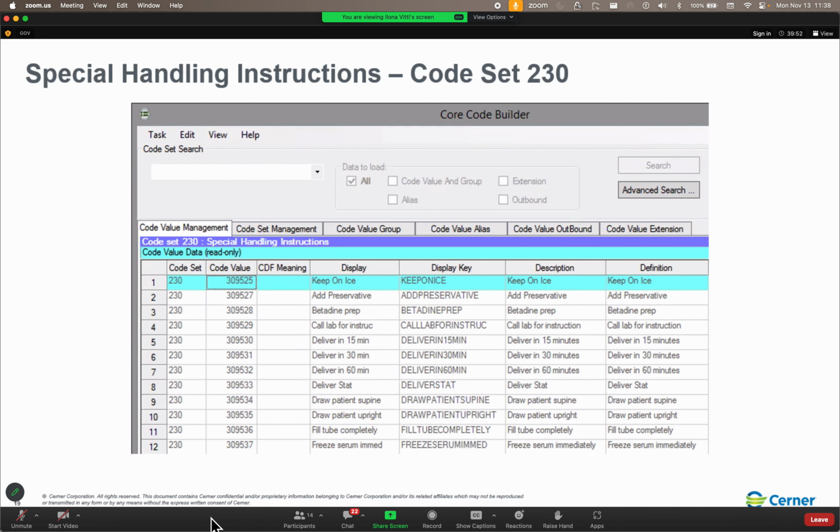And then over in APS maintained case, the AP folks go ahead and get everything hooked up that needs to be hooked up to that anatomic pathology order. But it has to have a value from code set 2052 in order to make it to the lab share.